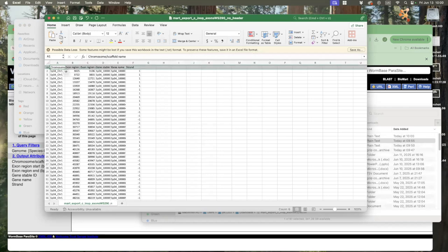Yes. And just delete the top row here. Okay. Save that.